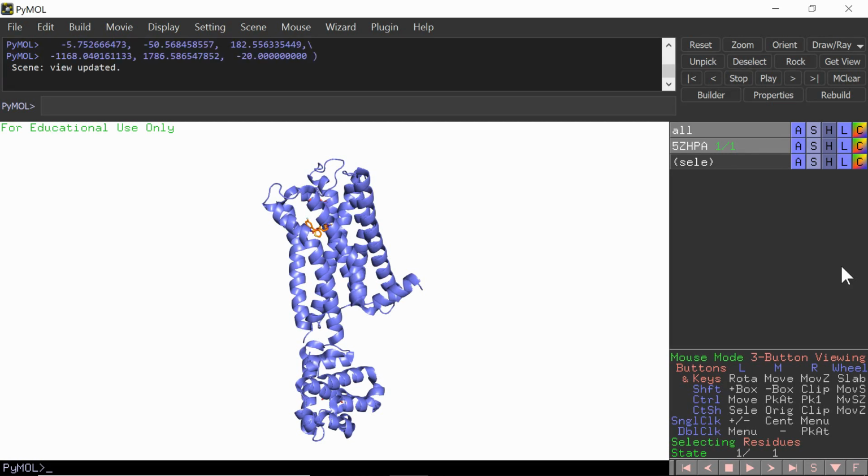Now I'm going to take a step back from the PyMOL session and go over representation types a little bit. There are various options in PyMOL for representing structures. There are appropriate and inappropriate times for every representation type. Appropriate and thoughtful usage ensures the structure looks as professional as possible. You are welcome to follow along by tinkering with your PyMOL session, however you are also welcome to just observe some good and poor usage examples following this.